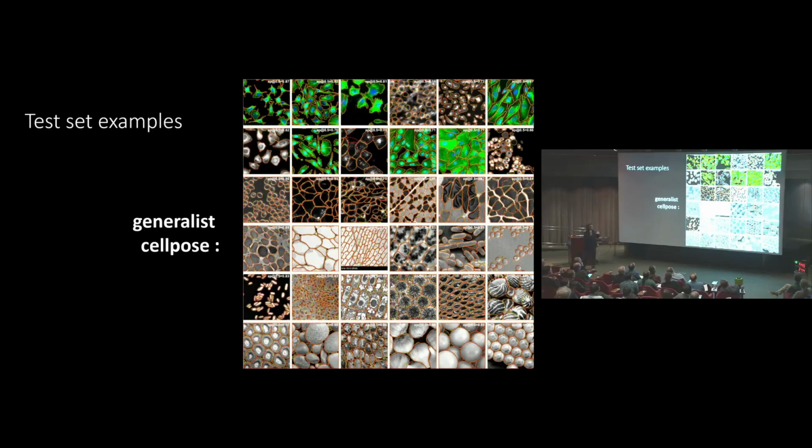Again, these are test images. For a lot of them, there is nothing in the training set that looks quite like it, because it's a one-off hit that we downloaded from the internet and just put into our database. And so across the board, the segmentation is pretty good. There are some mistakes here and there. We're going to come back to what to do with those mistakes towards the end.